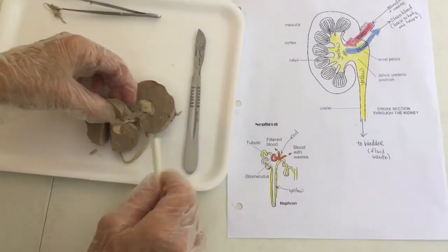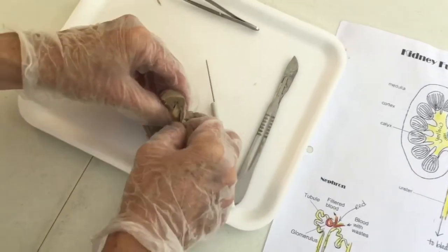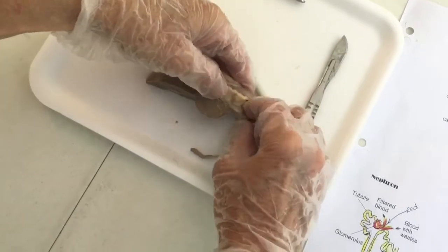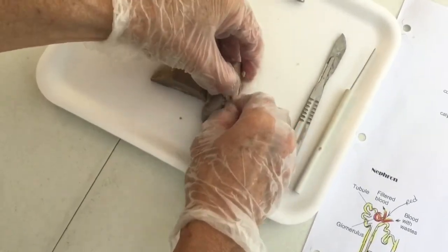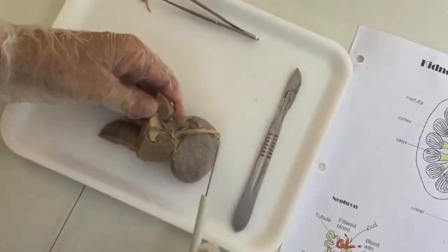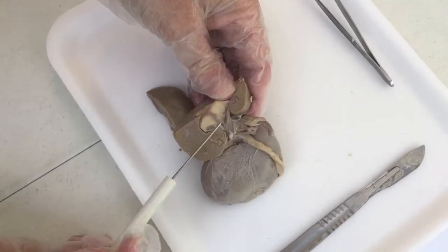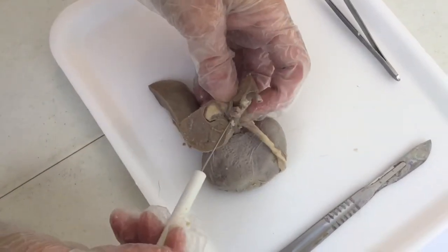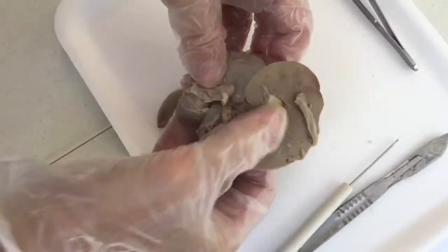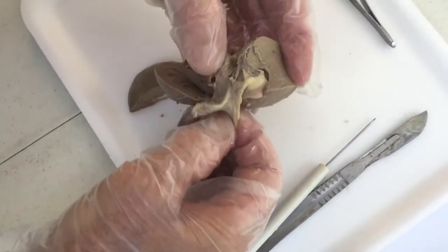Okay. Now, I'm just kind of playing around. Let's take a look at this. It's very tough. It doesn't want to just pull apart. But if you had one, you can kind of follow how the artery comes in and the vein goes out. And let's see, the ureter connects over here. See, back to where we were, back to that renal pelvis, okay?